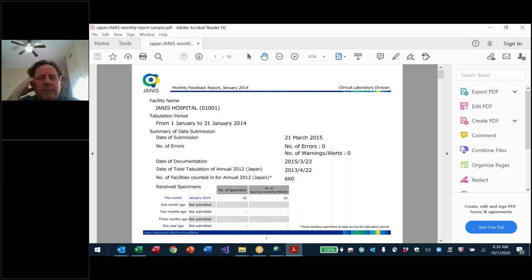Yeah, so DHIS2 is used in many countries for public health surveillance: tuberculosis, HIV, gonorrhea, influenza, diabetes, cancer. It doesn't have to be infectious diseases. So a lot of countries use DHIS2 for data management, but not for antimicrobial resistance. Vietnam decided to explore DHIS2 expansion to include antibiotic resistance. The problem is DHIS2 really is not well set up for it.